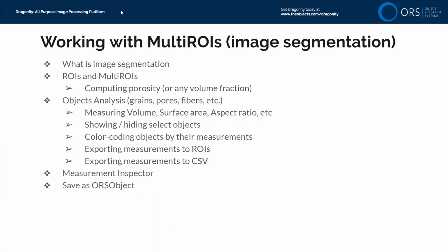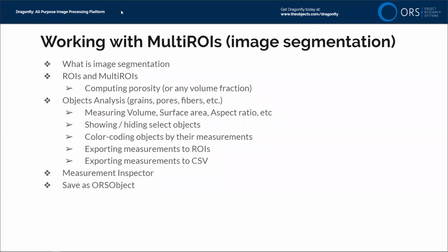So I've got 24 questions. I'm going to answer as many as I can in the next 5 minutes. The top question in my queue, maybe these don't stay sorted, is there an undo function in Dragonfly? That's a great question. I wish there could be.